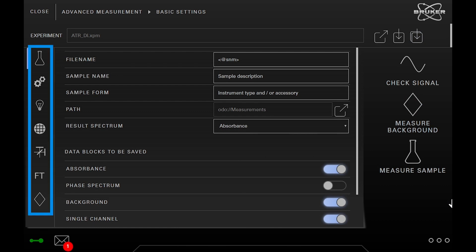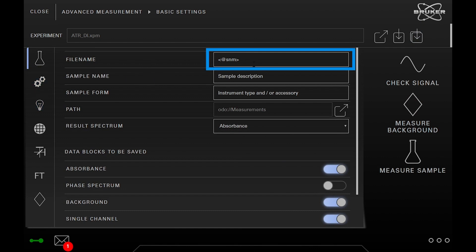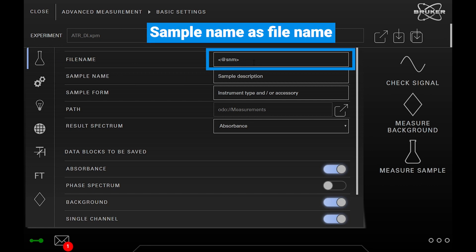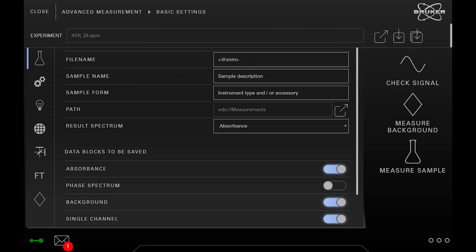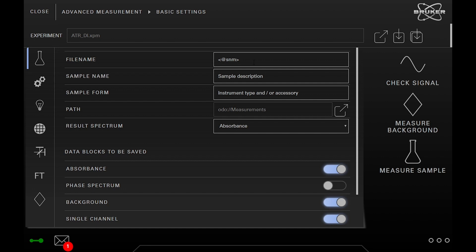On the left you can see the tabs with different settings. The upper one contains general settings such as file name or sample name. The file name currently contains a placeholder which uses the sample name as the file name. For demonstration we will change the sample form to the name of the used accessory and save back the settings to the already opened XPM.